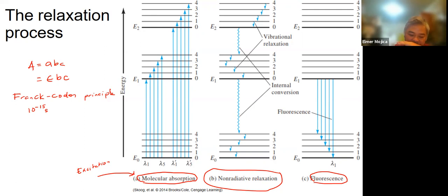So you promote it to a higher vibrational level in singlet state than the vibrational level that it was in the ground state. And then what happened there is there's a vibrational deactivation that takes place through intermolecular collision. And if you're going to look at the time scale here, there's around what we call 10 to the -12 second, and that is faster than the fluorescence process.